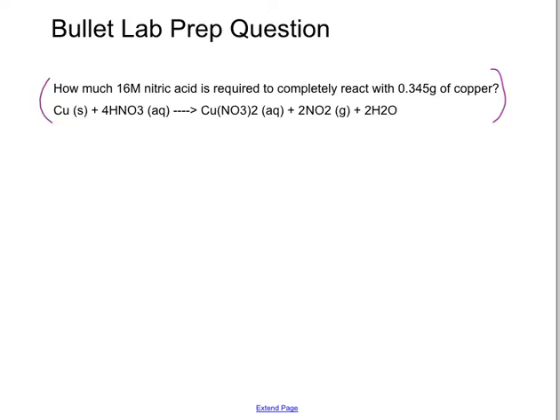So the first step of the whole process is to dissolve your bullet, or the casing, in nitric acid. It is a super duper cool looking reaction, and it's giving off NO2, which is toxic, but that's cool. It's under the fume hood. You'll be fine. And it makes a really deep blue copper 2 solution. So the brass containing the copper, we're going to dissolve basically the whole thing and make what I call bullet juice. It's a solution where your bullet is totally dissolved.